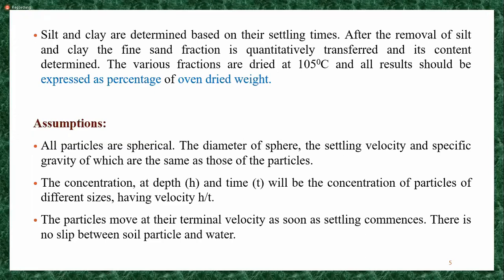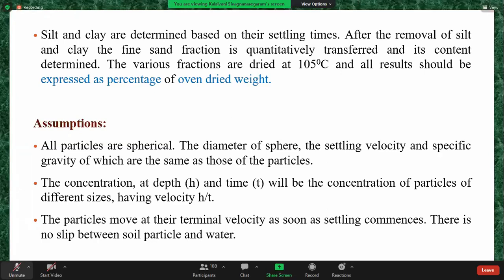When we are using this Stokes law, there are some assumptions that we have to take. Do you know anything about these assumptions? Viscosity, that means the dispersion medium viscosity is less.